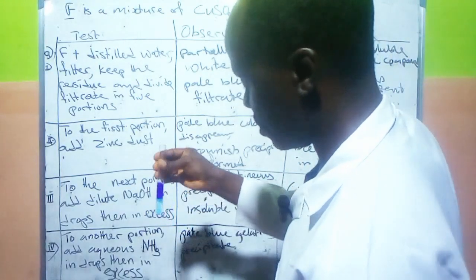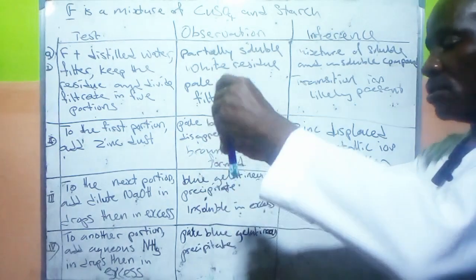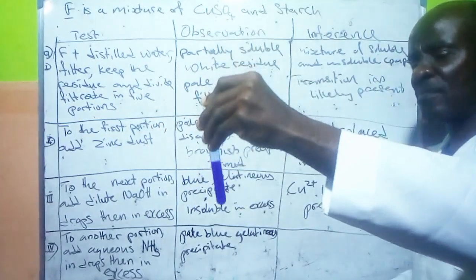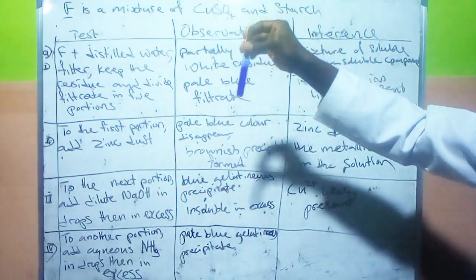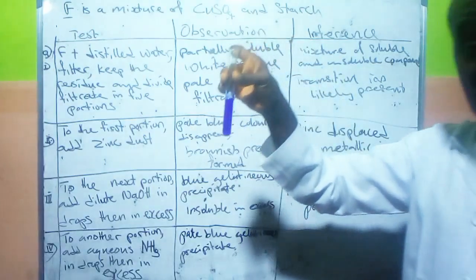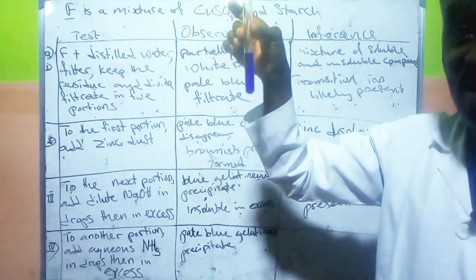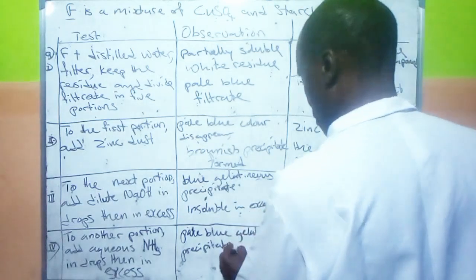Then let's see if we can mix these up and get the actual result. I don't need to add another one because it's already in excess. I've succeeded in shaking it so that all of them mix. When you're doing this in your exam, make sure you are careful about it. Now we have a deep blue solution, which confirms the presence of copper ion.